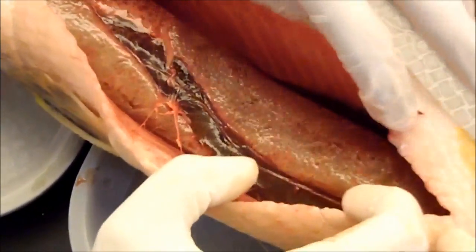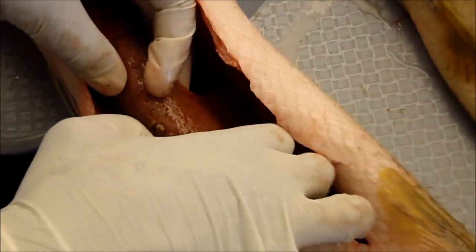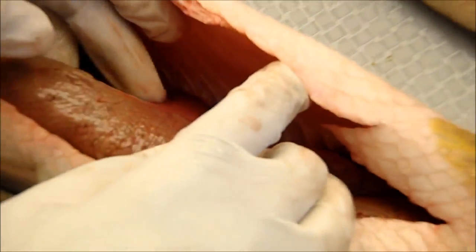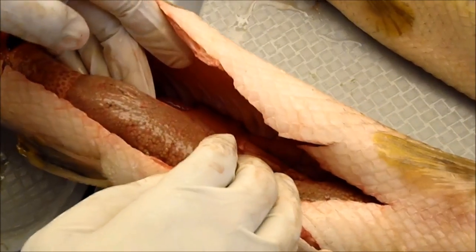Here you can see the large ovaries, and we're going to show you the oviducts, which is the connection of the ovary to the rest of the system. You can see this connection right here — in females it looks like a pretty consistent connection from around the kidneys to the ovaries. In males, it looks like a series of thin threads. This is what we use to definitively identify the sex. Also behind it, you can see part of the gas bladder, which runs the length of the dorsal portion of the fish.